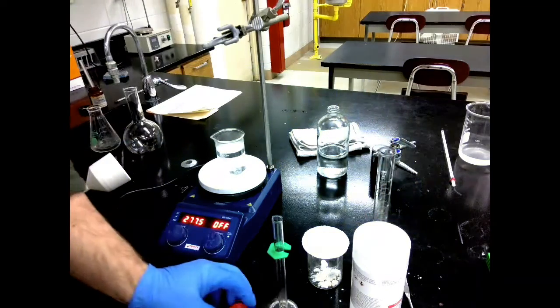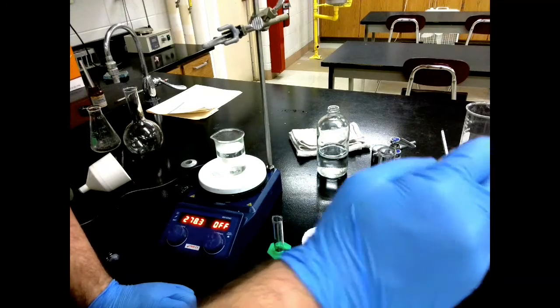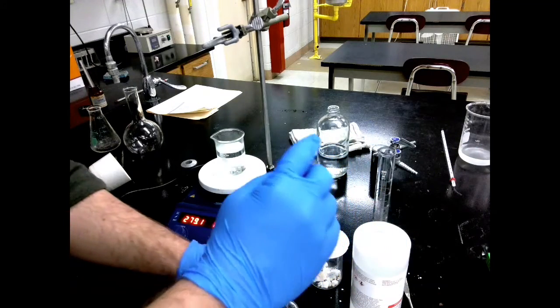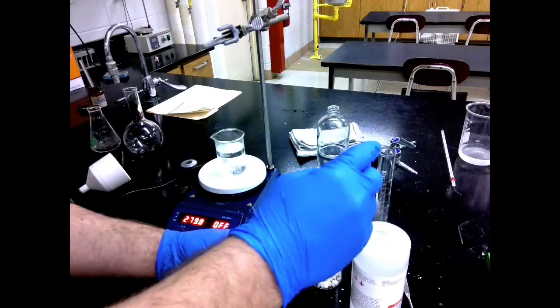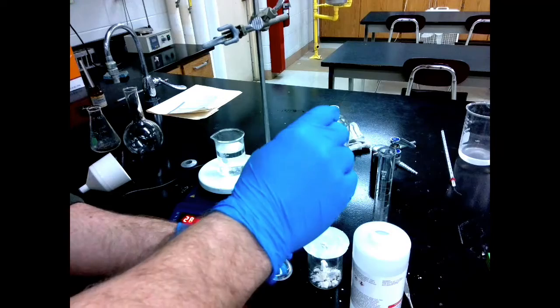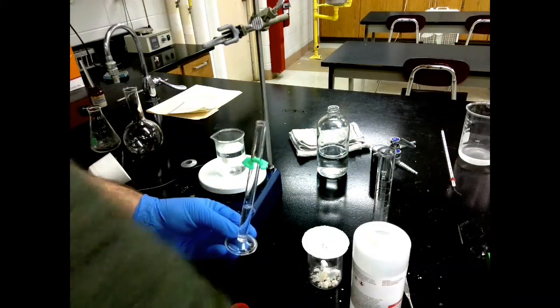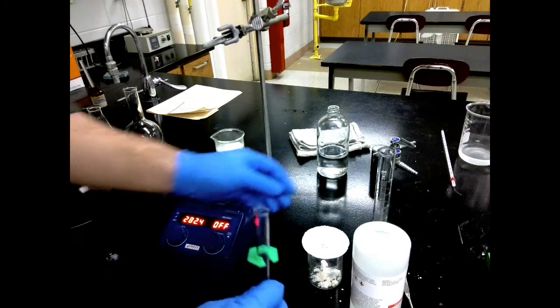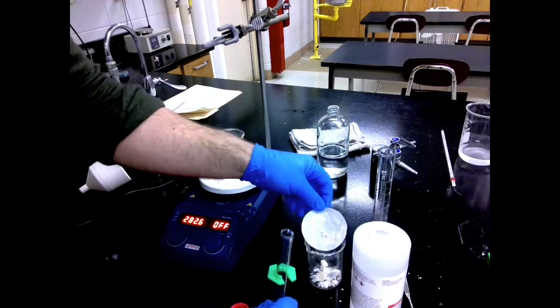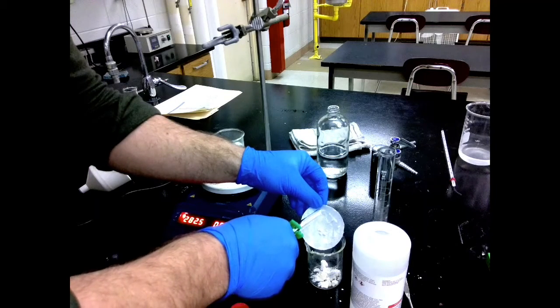Now I want to use just a little bit because ethanol is very good at dissolving aspirin. So if I use too much, it's just going to lower my yield. So I've got just about 5 milliliters. And so I'm going to take up my filter paper. And I'm just going to pour this down on it, just a little bit at a time.